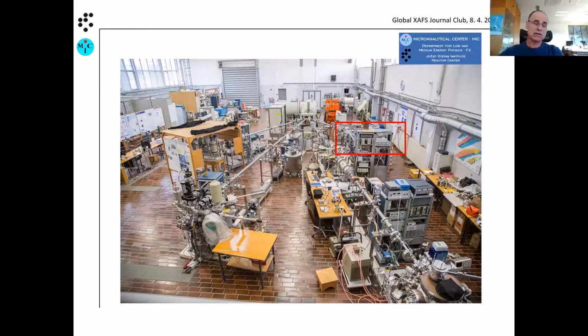We have a 2 megavolt electrostatic tandem accelerator to produce ion beams, and these are used for different techniques, which are not so relevant now for this discussion. But of course, you see at the back there is our chamber, installed at the minus 30 degree beamline. That means we can also provide MeV protons, which we typically use on our specimen. This is an effective way of inner shell ionization, and you will get X-ray emission. Non-resonant, of course, because these are charged particles. And then if you put in the spectrometer, you can do X-ray emission.